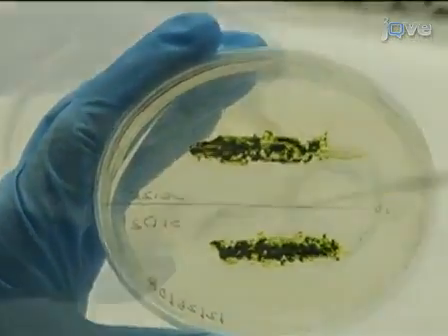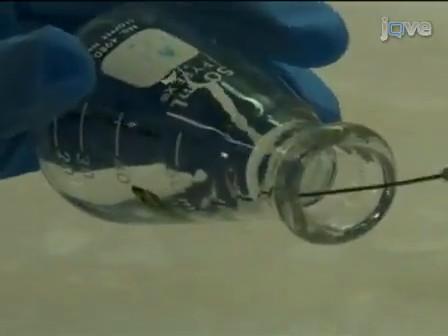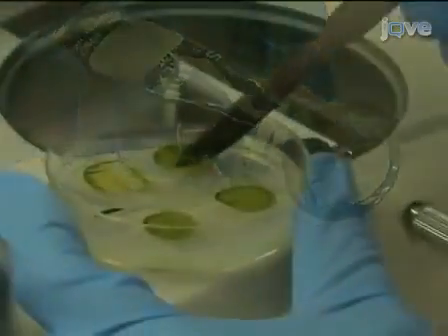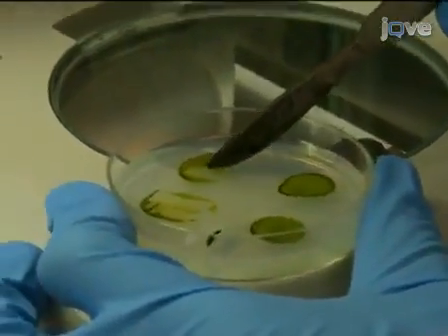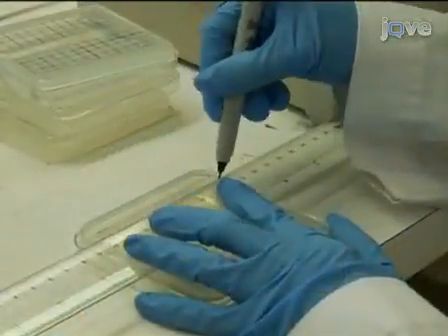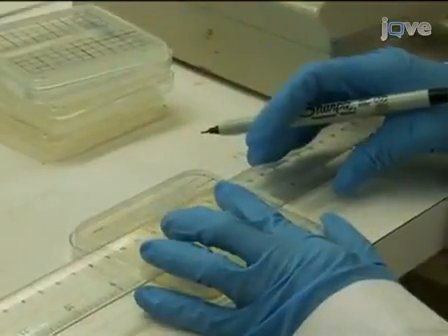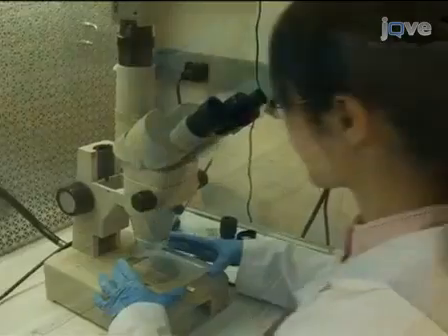Many laboratories use these techniques to create vegetative diploids for analysis of dominance, or following tetrad dissection to ascertain nuclear versus organellar inheritance, to test allelism, to analyze epistasis, or to generate populations for the purpose of MAP-based cloning.